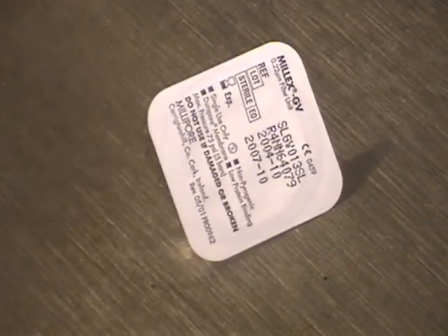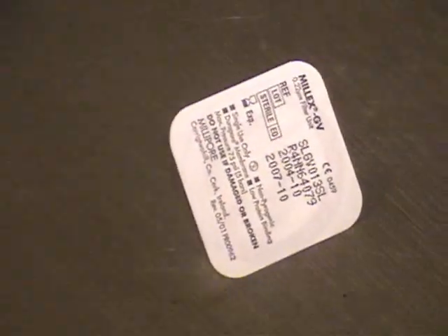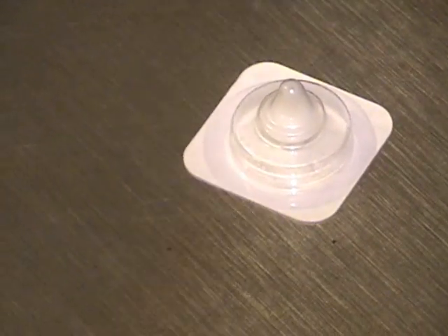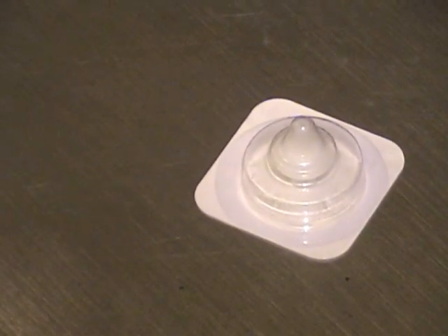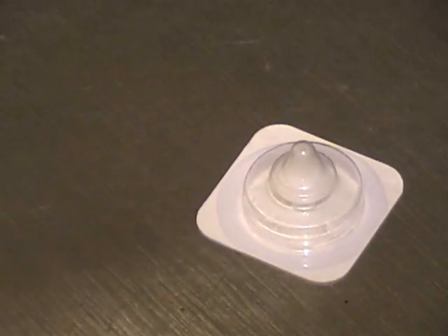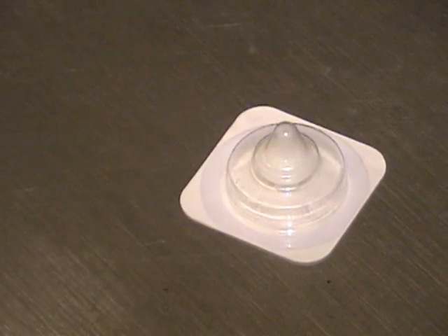This is a filter that we use. Sometimes customers want venom to be completely clean, and we can use this to filter small quantities of venom. Basically this is a syringe filter — you pull the venom up into a syringe that has a luer lock on it, and then the filter locks onto the syringe, and you manually depress the plunger and it forces the venom out through the filter.